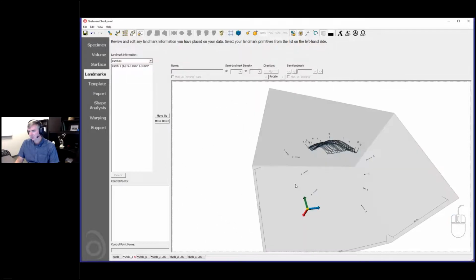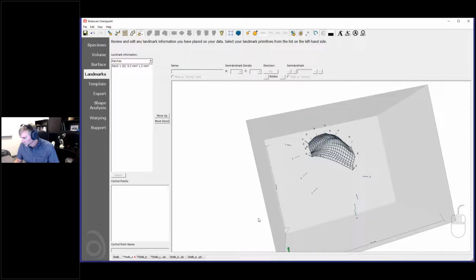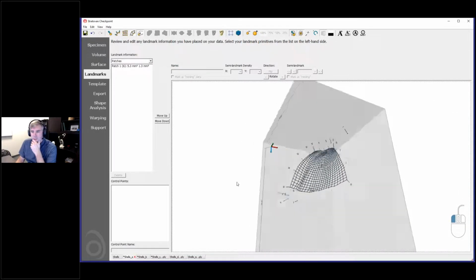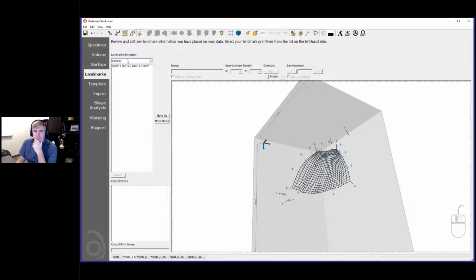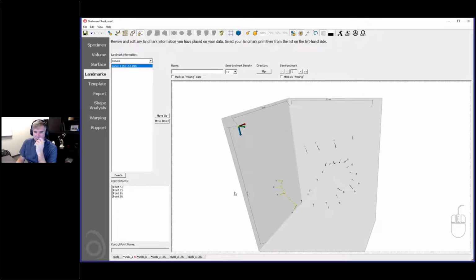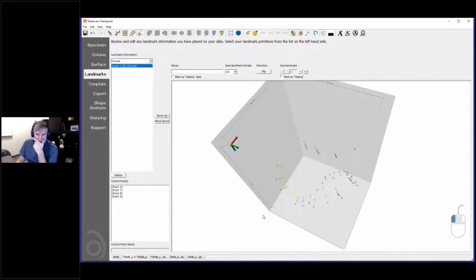Yeah, we got a couple questions I think we should go back to. Regarding the curve where you change the order, it appears that even though we've changed the order, it's still ordered from, let's say, 5 to 9 when it's exported. Are we looking at this wrong? This will change the ordering, so you might need to study the points. Let me get rid of some things. Let me get rid of the curve. Sorry, the patch.